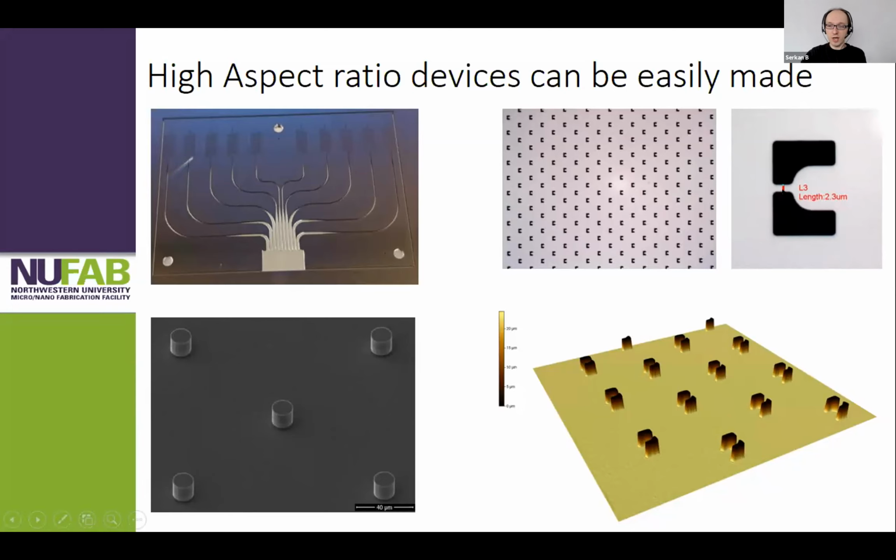So these are kind of like traps. They are embedded in the microfluidic channels. They're supposed to catch some particles for further analysis. So the particles in the liquid are carried through these traps, and then they will be caught in these openings, and then some confocal microscopy or whatever you can think of, you can do that later. So the openings between these two fancy shaped pillars are about 2 to 3 micron, and we achieved almost 30 micron deep holes to make the PDMS casting with these things.